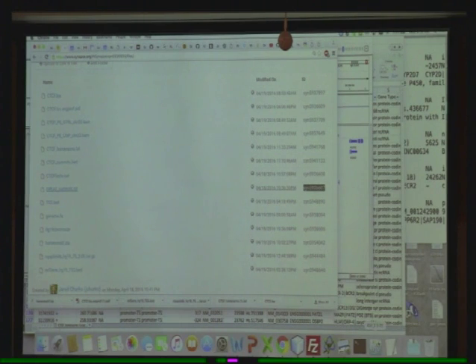Quick question, how did you find that chromosome 19 file? It's part of the MACS testing files. If you wanted to test out MACS, they include the BAM files. If you download the program, it's part of it. But usually if it's your own data, you run Bowtie and then you get a BAM file, and you work from there.